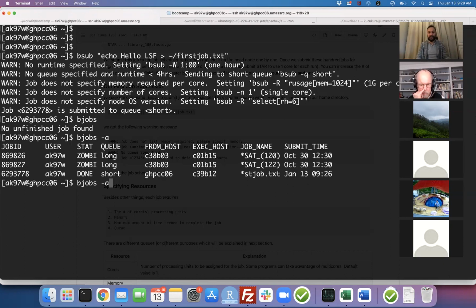Because usually when you do an RNA-seq run, you're going to see, tomorrow or next week, that you're going to do lots of runs, and you have to follow up on every single job you run. Otherwise, one sample will finish successfully, the other won't, and when you want to unify them in a single table, you're going to have missing samples. You don't want to do that. You just want to follow up.